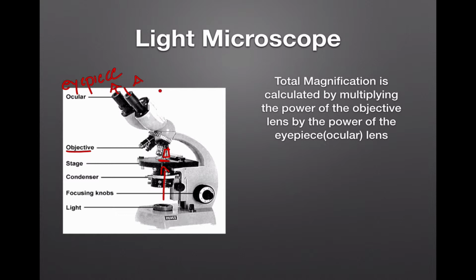A light microscope like this is a compound light microscope. It's called a compound light microscope because you can choose 1, 2, 3, 4 different magnifications here with different objective lenses. This whole nose piece rotates, so you can choose how much you want to magnify what you're looking at. So that makes it a compound microscope.